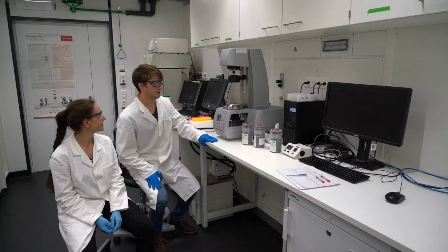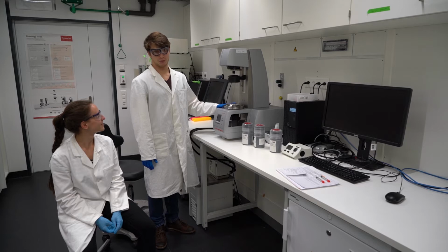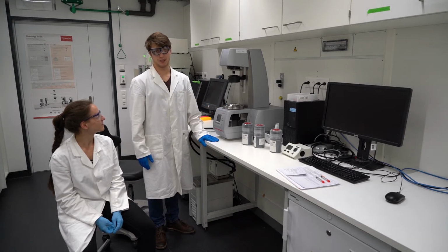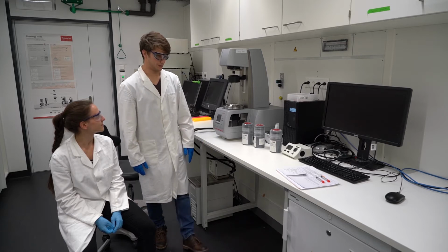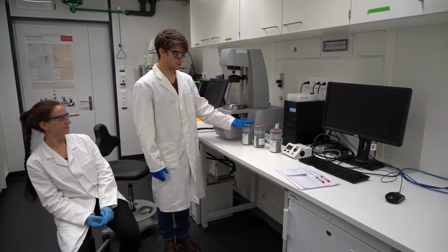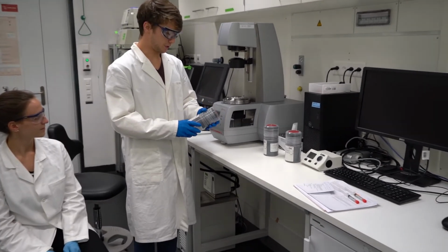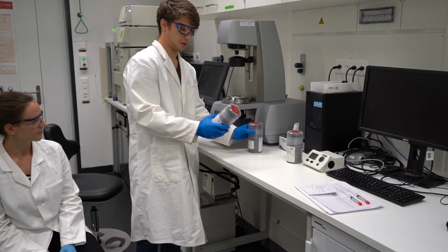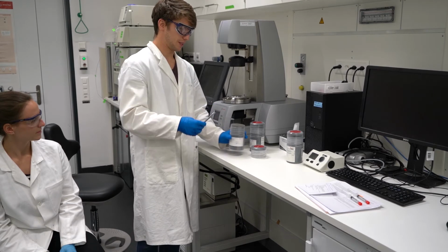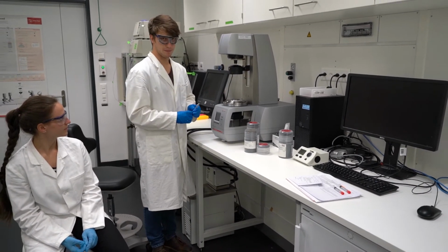So what we use to characterize these viscoelastic materials is a rheometer, which works in shear directions and not normal direction as in common compression and tension experiments. So we have different options, and we're going to squeeze our materials through different geometries. For today's experiment, we're going to use cone and plate geometries. Then we're going to first mount our device on the rheometer.